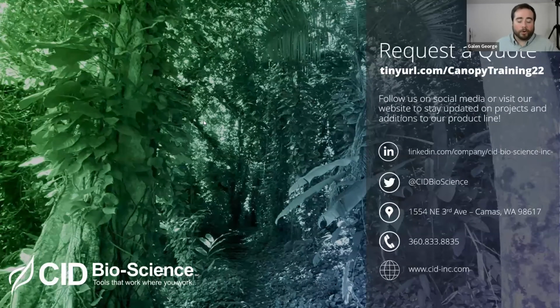And it's better to have more than less so we can average them because they're in different positions, right? We have sensors that are farther out towards the head. We have sensors that are closer towards the base of the instrument. So we can average all those together to see what the average PAR reading is, as opposed to what you would get from just one.